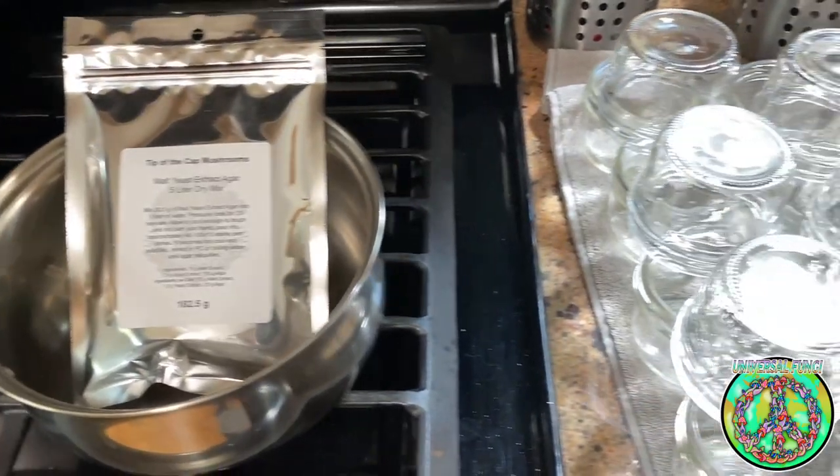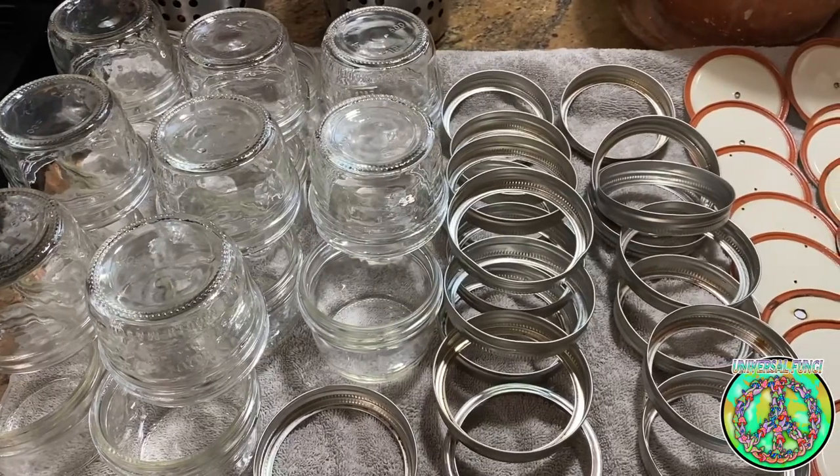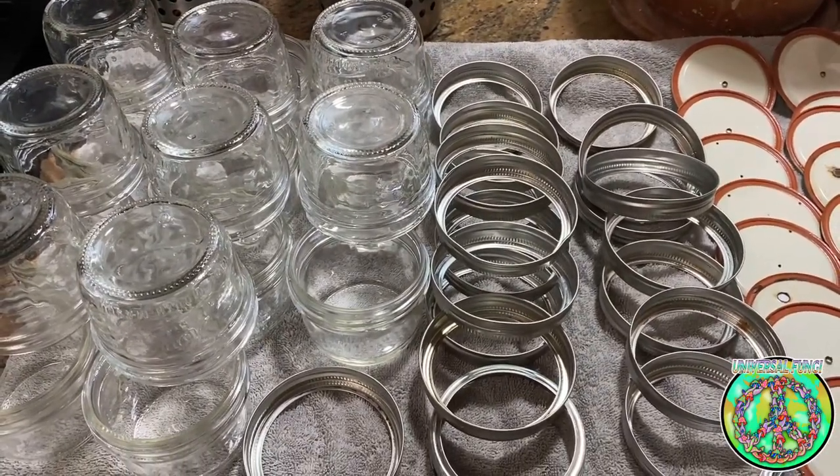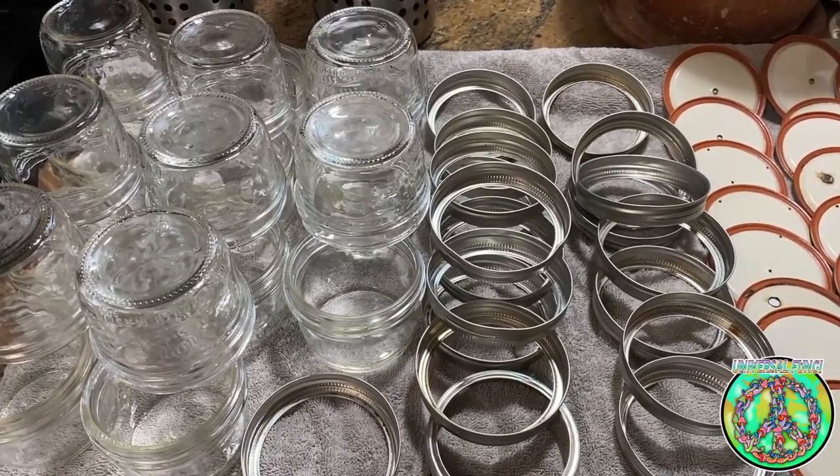The materials I used and you will need to do this tech are two ounce mason jars, agar pre-mix from Tip of the Cap Mushroom, a gram scale, a pot, and a pressure cooker.